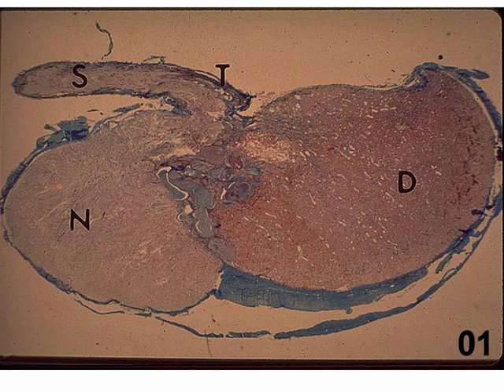So now we're again looking at the entire pituitary in cross-section. And here's the infundibular stalk coming down into the pars nervosa, which is what we just looked at. As you learned about in lecture, the pars tuberalis carries blood vessels with releasing factors down into the pars distalis. So now what we're going to do is to look at a region of the pars distalis in higher magnification. For example, the area that is within the circle.